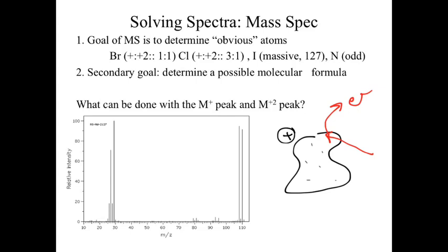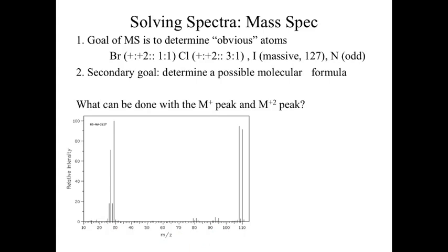So if we now take a look at our sample mass spec, what we've got along the x-axis is an m to z, also known as a mass to charge ratio. Well, in the mass spec that we're going to be dealing with, we're only dealing with a charge of +1, which means those numbers represent the mass of something found at that particular weight. Okay? So we don't have to worry about charge at all anymore. It's just, hey, that's the mass. So nice and clean.